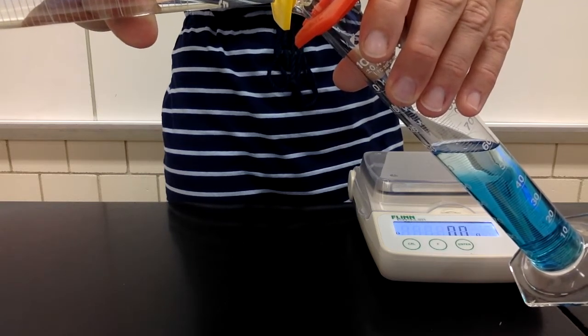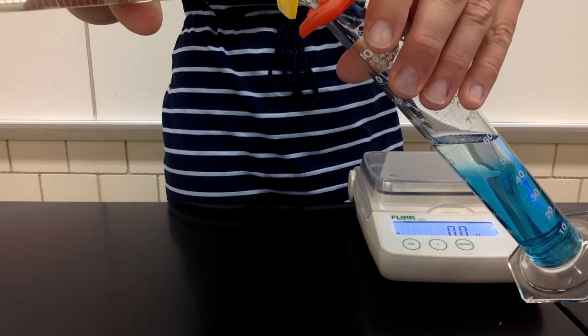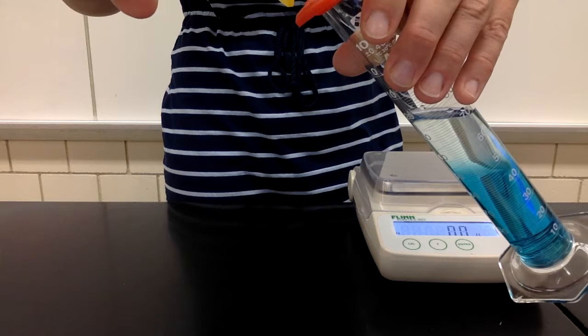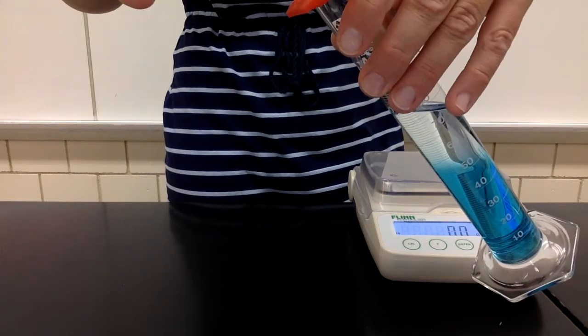You can see the ethanol forming a clear layer on top of the dyed water, letting the ethanol very carefully go down the side of the water's graduated cylinder.